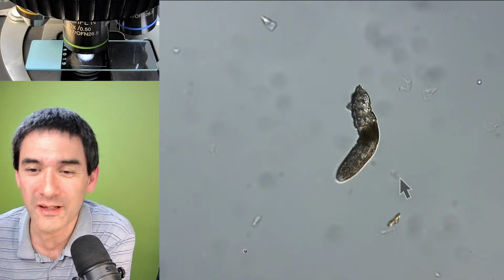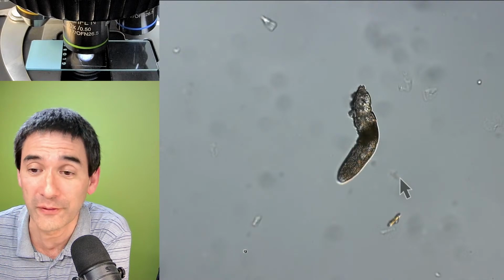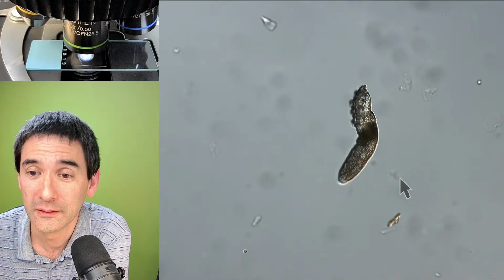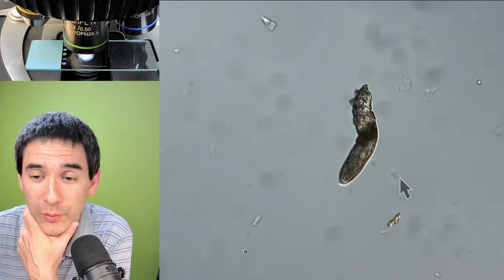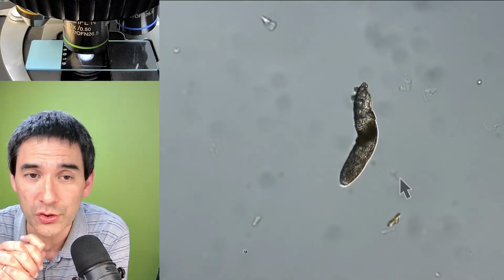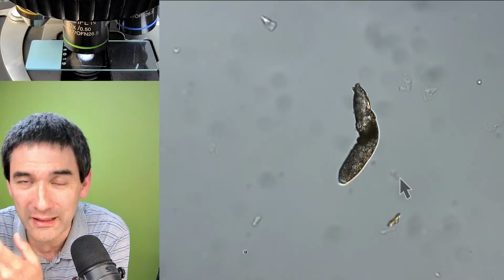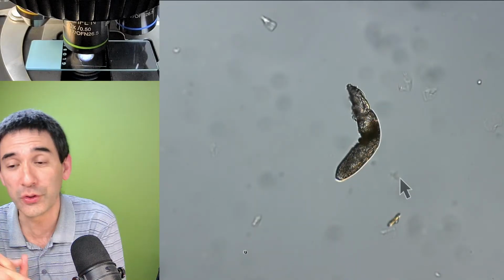Hold up, one of these face mites has a very long tail. Yeah, that's the one that I just showed you, which then I was not able to find anymore, right? How long does a face mite live? I don't know. I read it somewhere, and what they do is they keep on reproducing. But that's something that can be, I think, easily researched. They keep on reproducing, they crawl out at night, they mate, they lay eggs, and then you have a next generation forming. Lifespan of around 14 days.